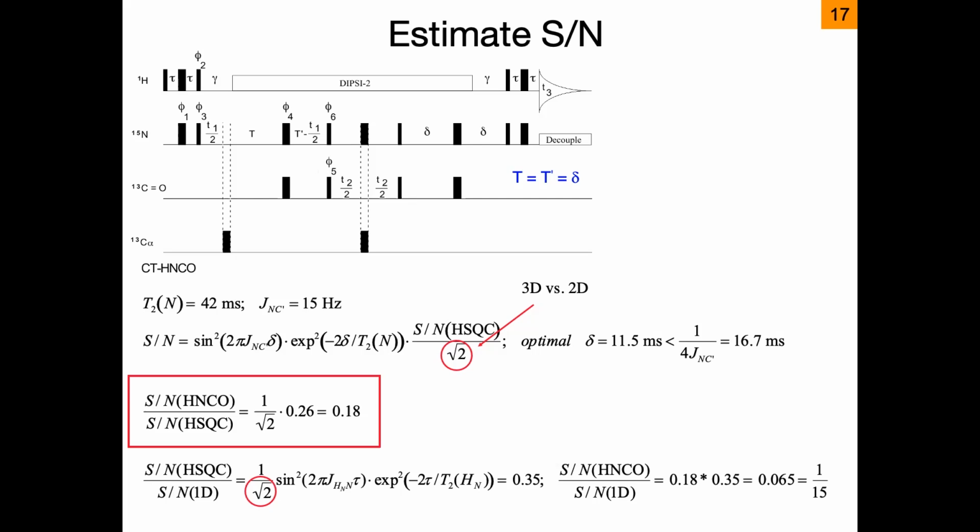And to record the X and Y components of your signal, but only full signals is maybe when you start with X magnetizations only in the X channel and not in the Y channel. So in the Y channel, there's nothing. So you need twice the experimental time or FID acquisitions to record the same intensity. And therefore you lose a square root of 2 with every additional dimension that you record, even if there's no additional relaxation happening.